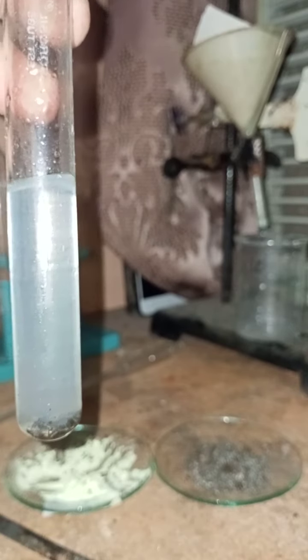You can see I have added carbon disulfide to the mixture, and now I'm going to perform a process known as filtration.